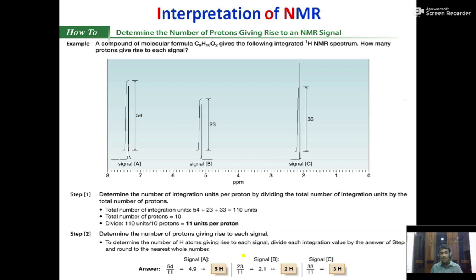This NMR spectroscopy is quite sensitive. It can detect the signal up to the 7th decimal point with accuracy. We are generally sticking with 2 decimal points or so.